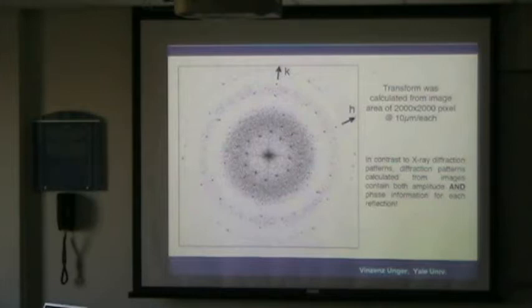So in this case, we need to correct for these rings, and this is called the contrast transfer function. That's a lens-based problem. What people sometimes do is collect the diffraction pattern in the microscope by switching off the lens. Then they don't get an image anymore, but they get a diffraction pattern, and that diffraction pattern is not overlaid by these rings.